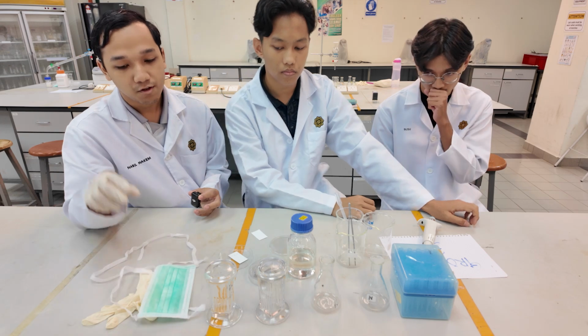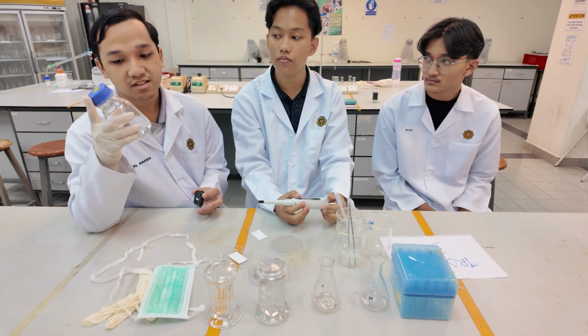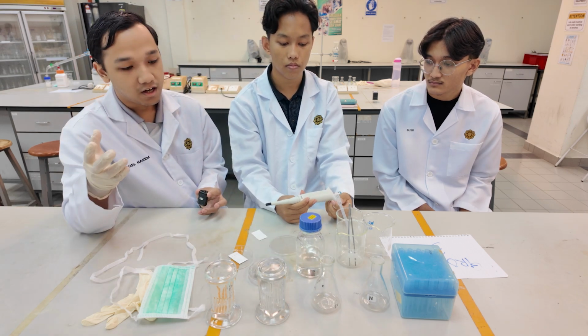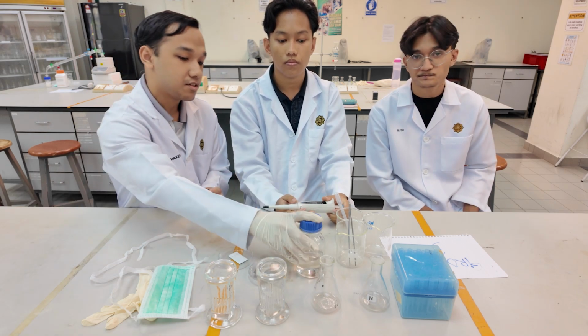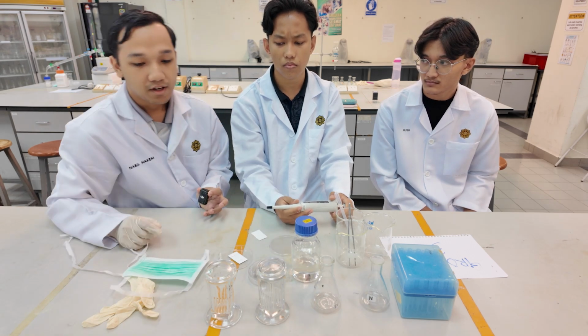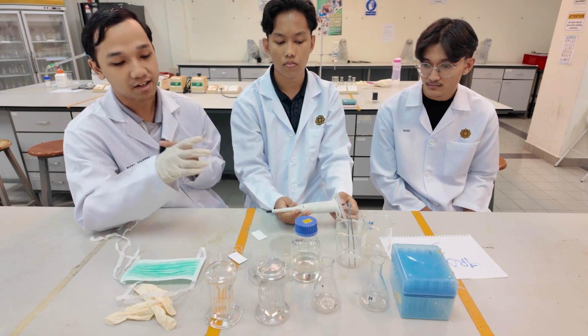Mostly in TLC, we will handle these chemicals. These chemicals are highly volatile solvents, so they easily evaporate into the surroundings. So we need to wear a mask and gloves to protect from skin contact.